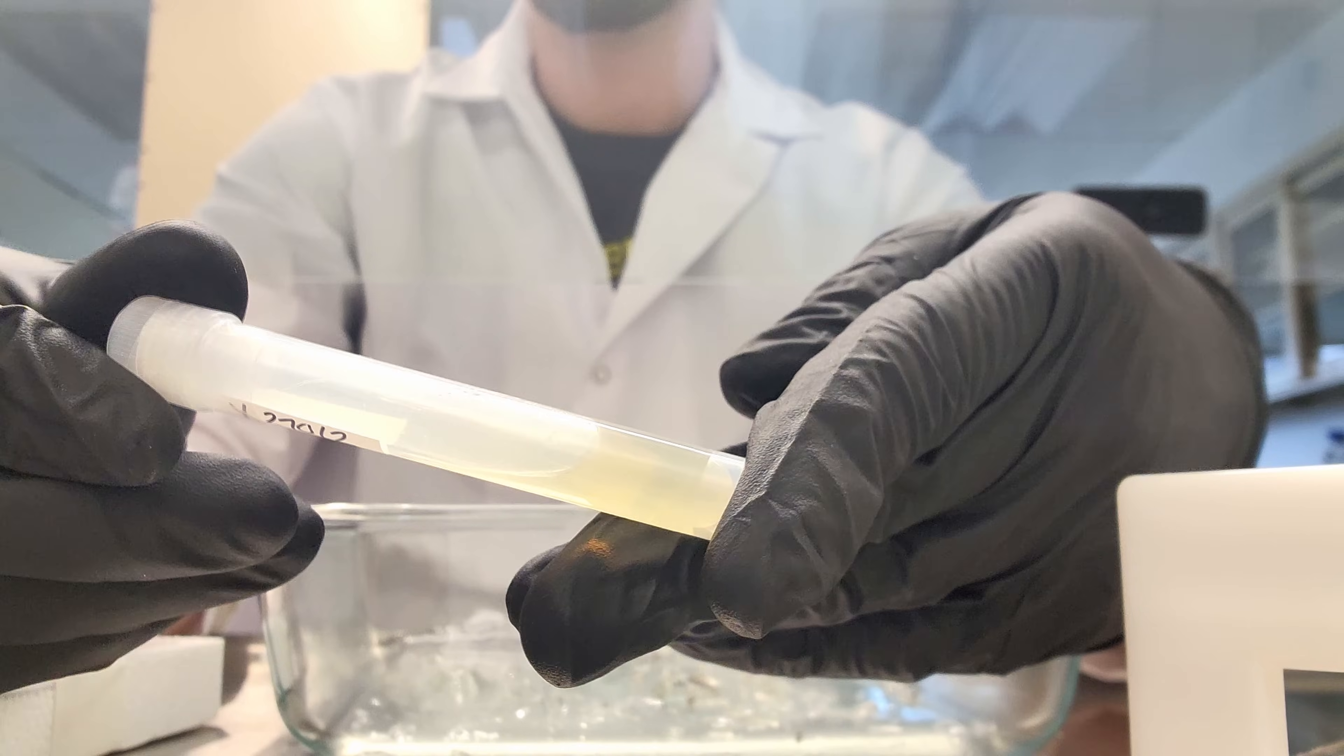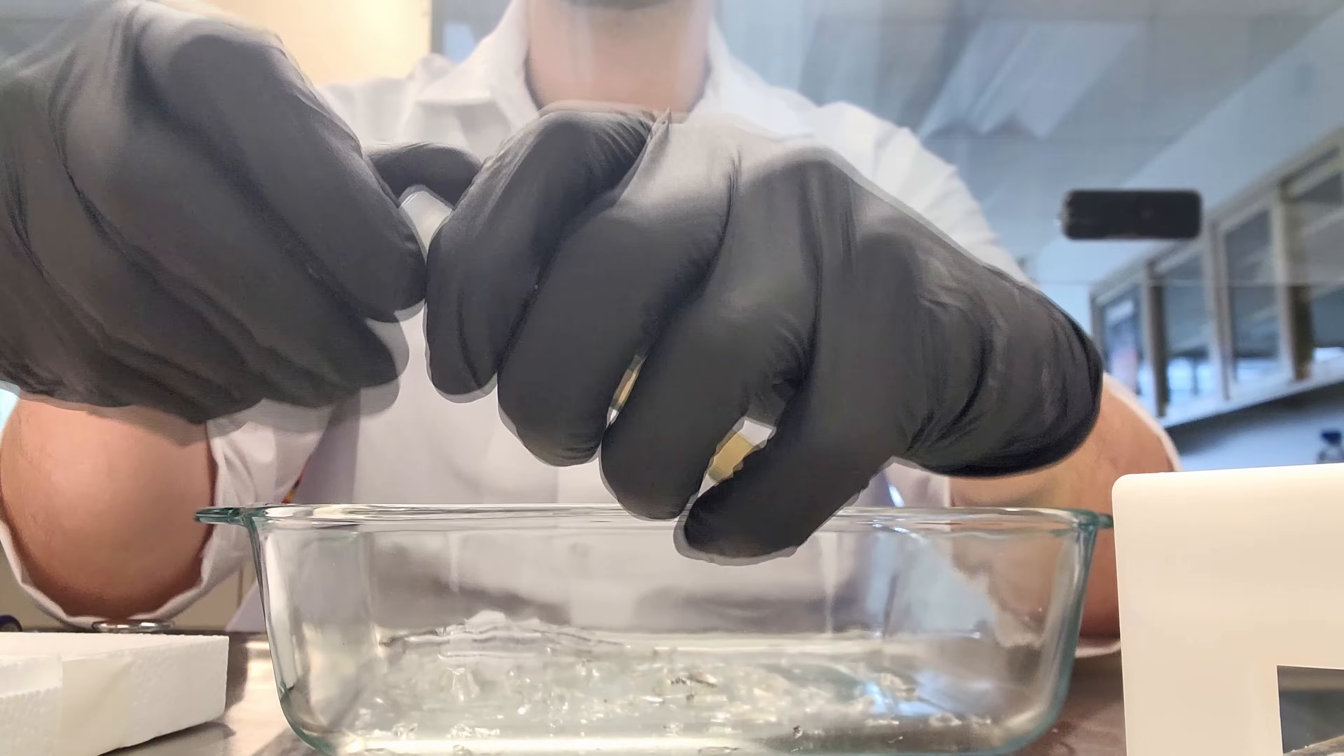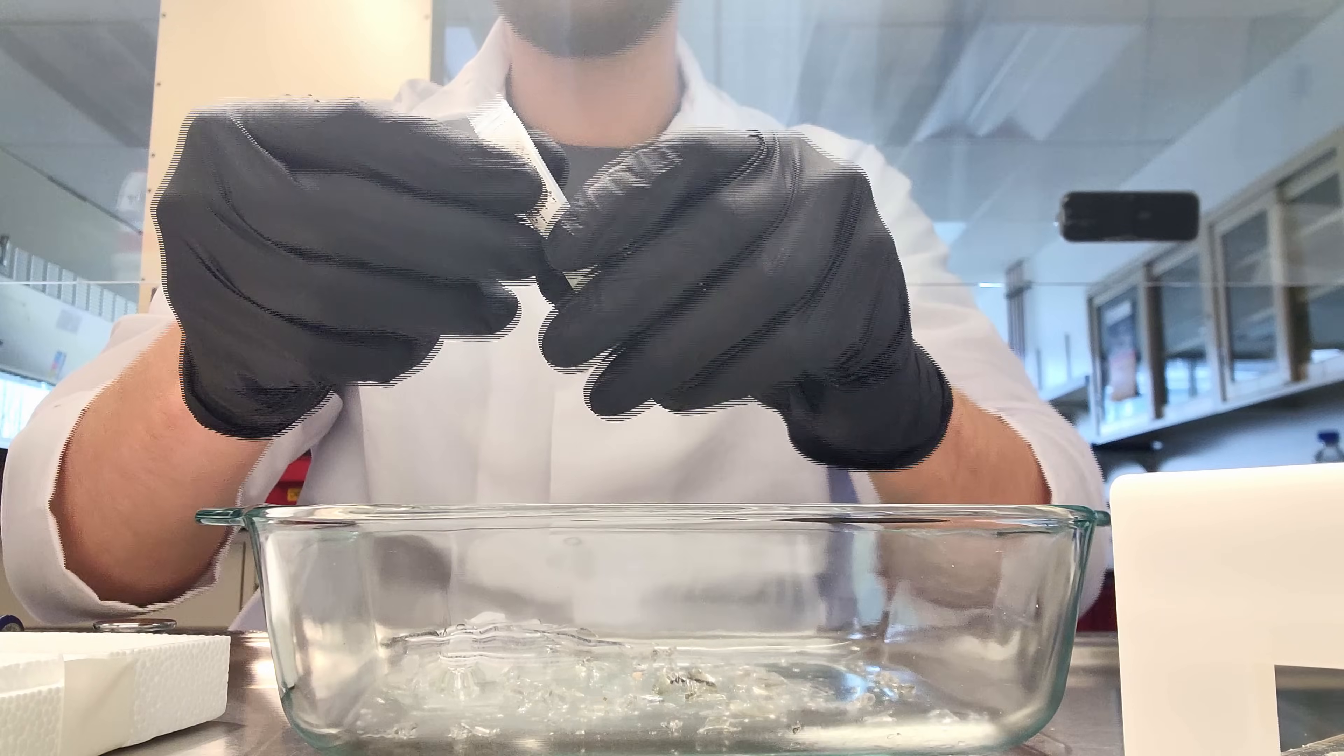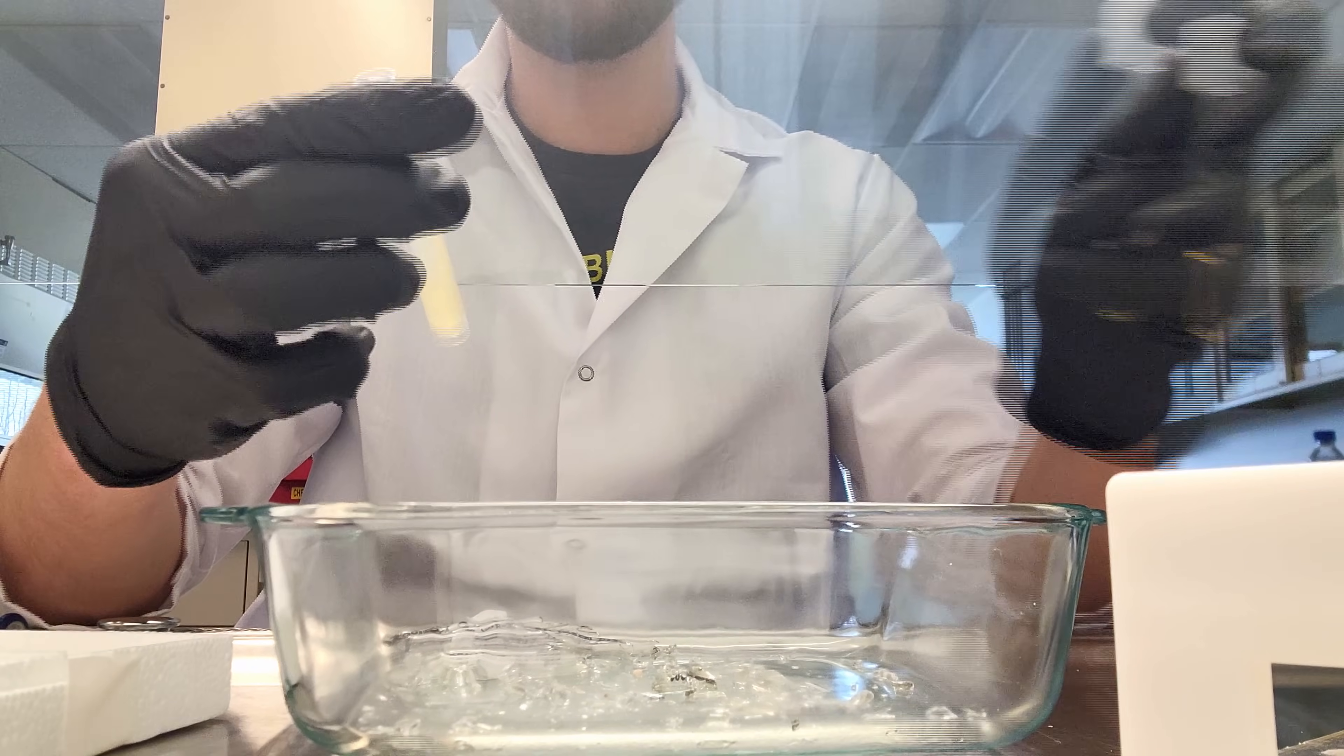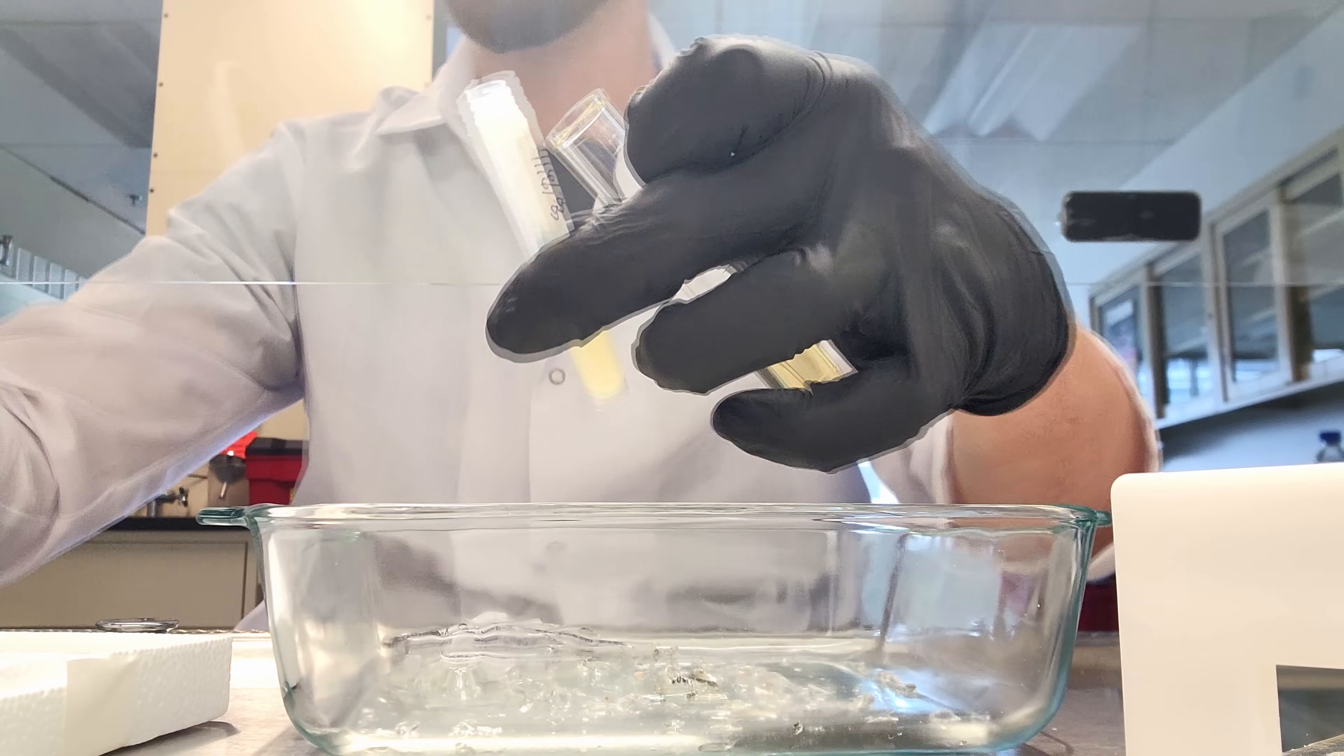Finally, the last format you'll see is what's called a slant culture. This is actually agar in here, and the cells are sitting on top of the agar like a petri dish. This is something that needs to be made fresh—this isn't a long-term storage solution—but this is how the strain was sent to me.